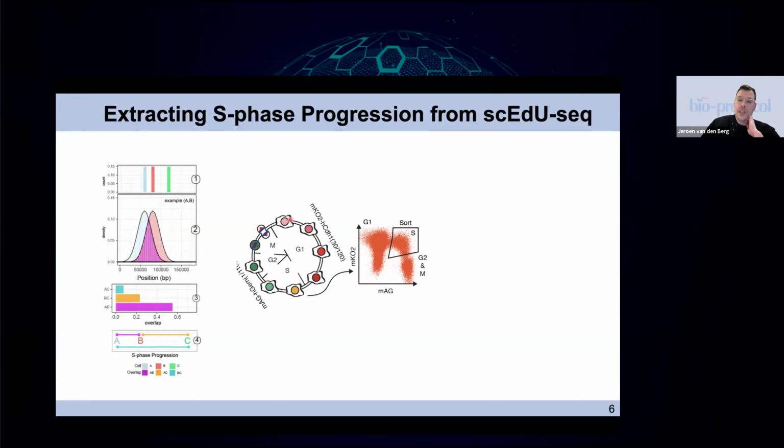So cells in early G1 will become increasingly more red until they enter into S phase, and then they will start to create the green fluorescence. So as an overlay, that will be yellow. And then it will lose the red signal, and then it will accumulate the green signal until it enters into mitosis and then continue on. So basically, you can read this as sort of a circle around this axis.